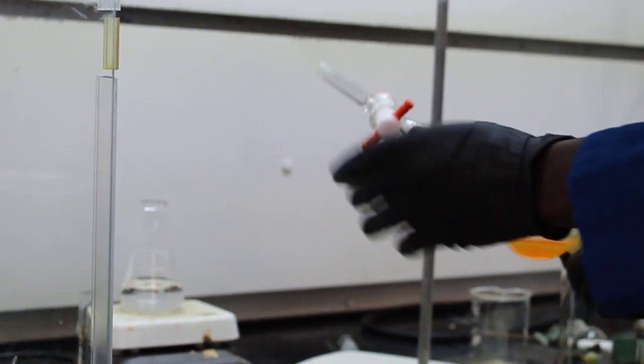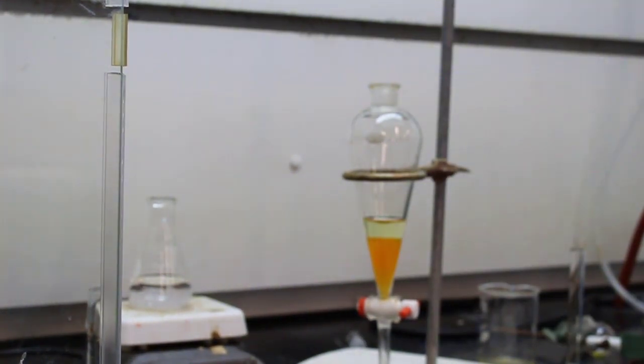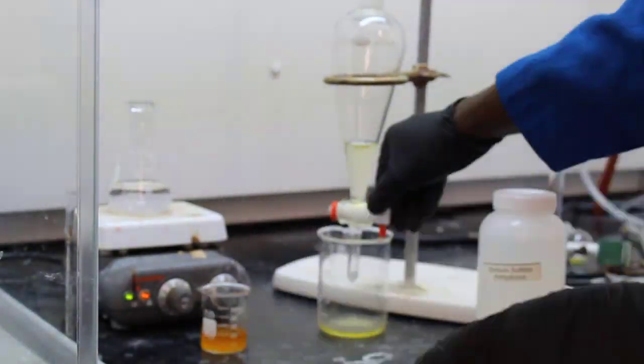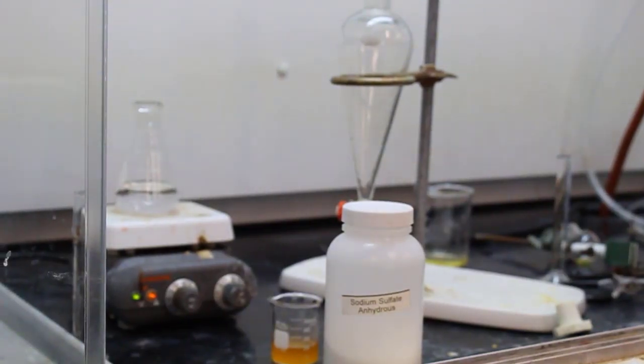They're going to do another wash using brine — a saturated sodium chloride solution. The organic layer is still the orange color, and the brine solution from the top is collected in the larger beaker.